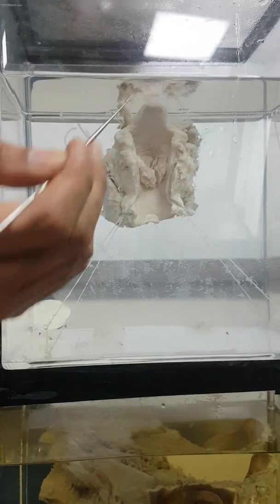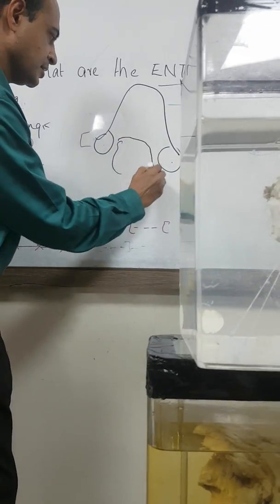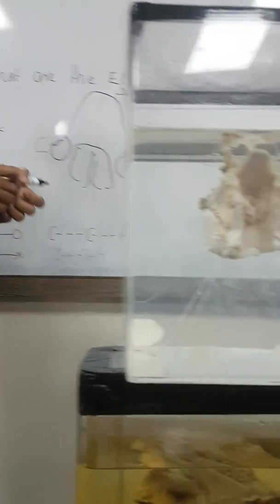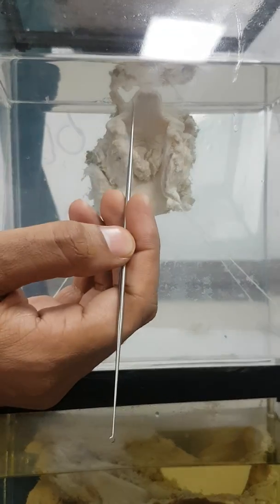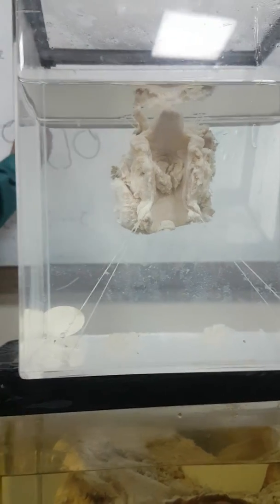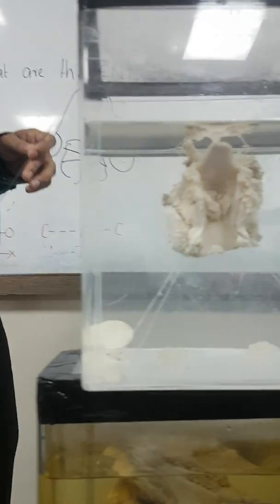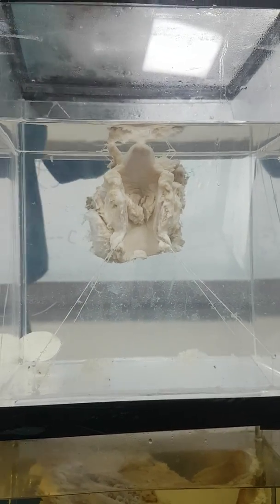In the center you are seeing an irregular growth - in this part you are seeing an irregular growth. The epiglottis, arytenoids, the entire part is the larynx. The center where the growth is present is the area of the glottis, where there are vocal cords. So this is the area of the glottis - glottis is the area where there are vocal cords.